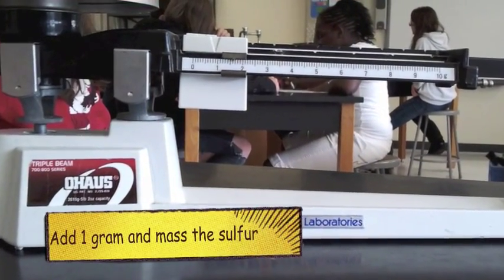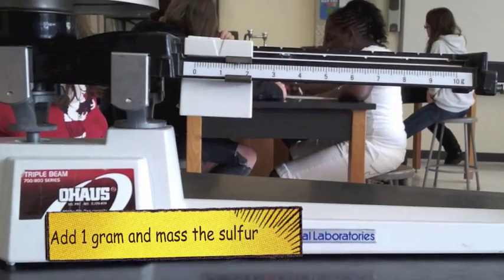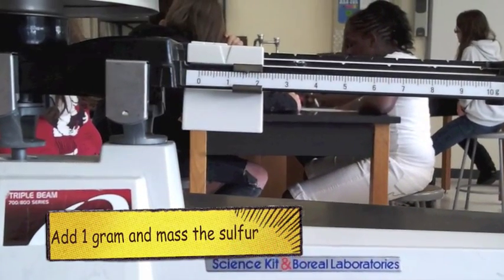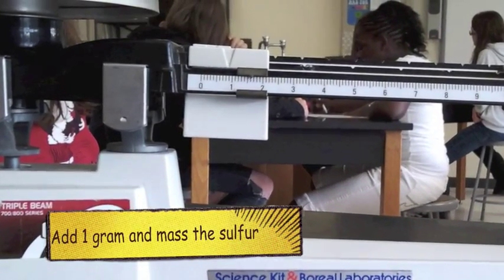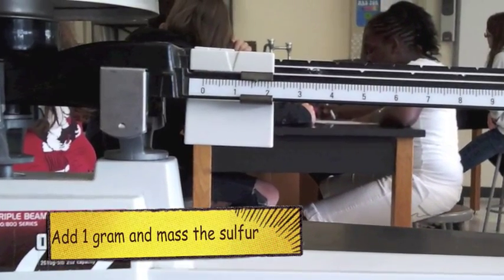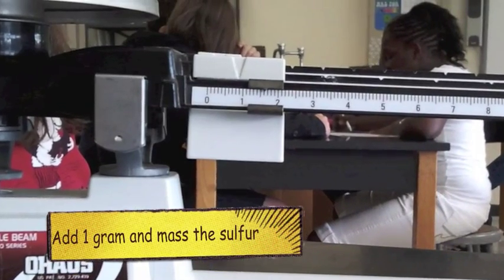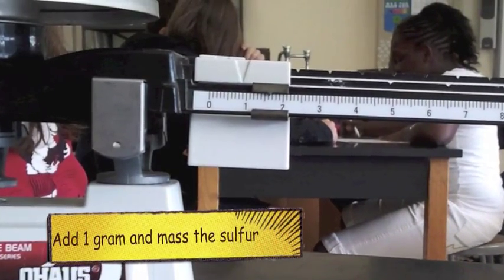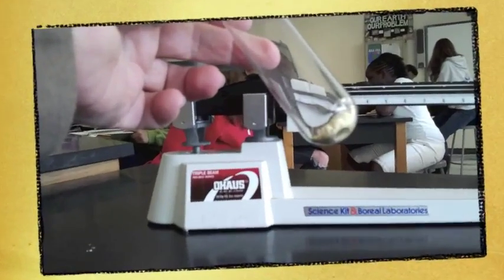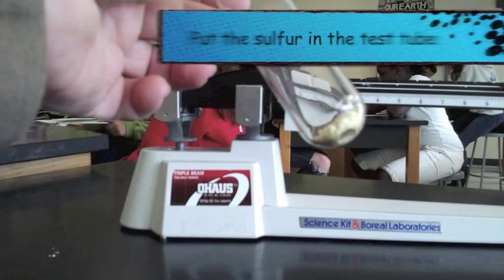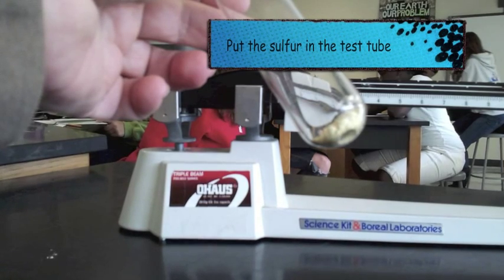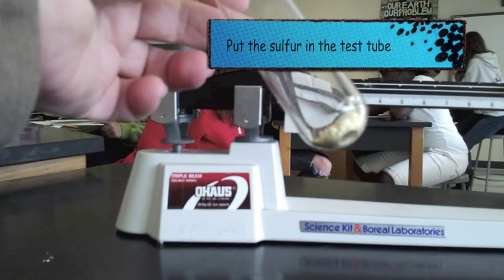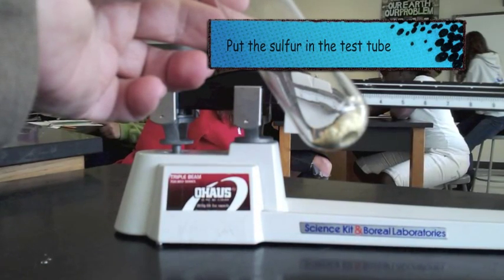Since we need 1 gram of sulfur, we're going to set our balance at 1.6 and begin to measure out the sulfur. When we have our 1 gram, we're going to put it in the test tube and set it aside.